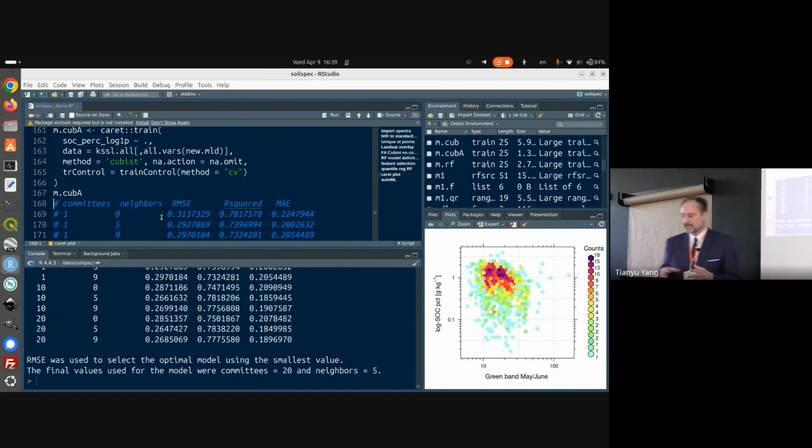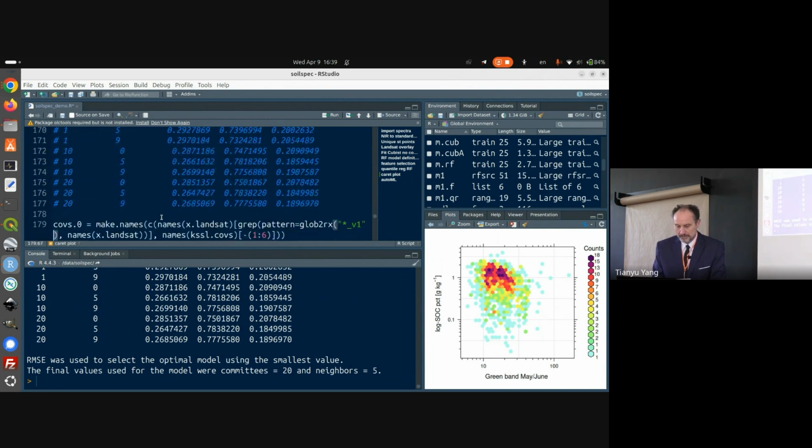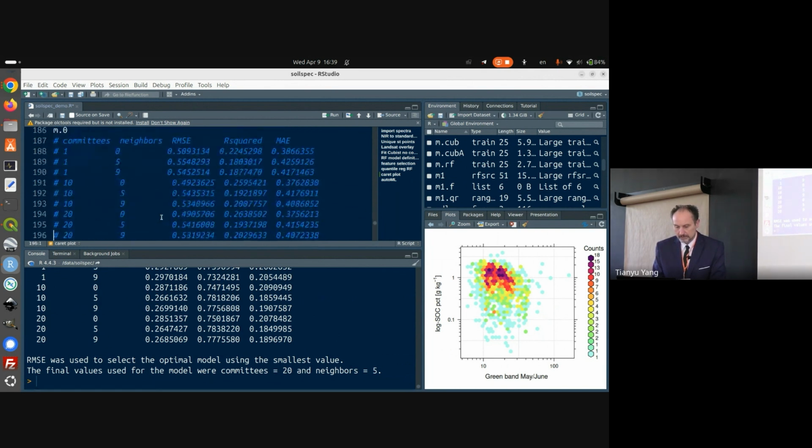Because this PC4 is so dominant, it's just one principal component of the spectra. Neospectra helps you determine the carbon really so distinctly. You only need that one component, and this helps you so much. So the Landsat gets lost inside. It shows up in the variable importance, but it gets lost in the effect on the accuracy. Then I can plot this difference in the accuracy.